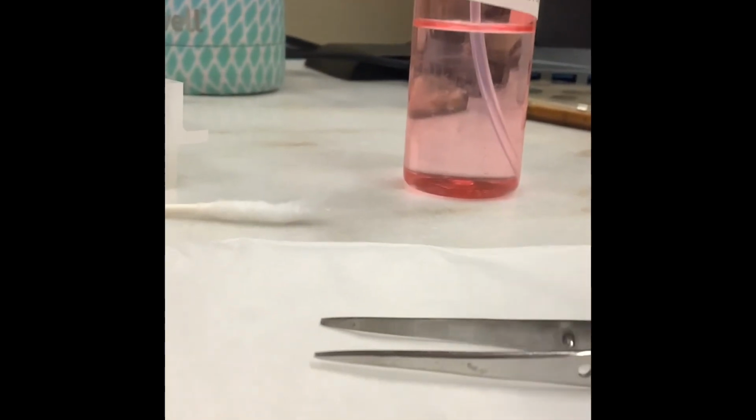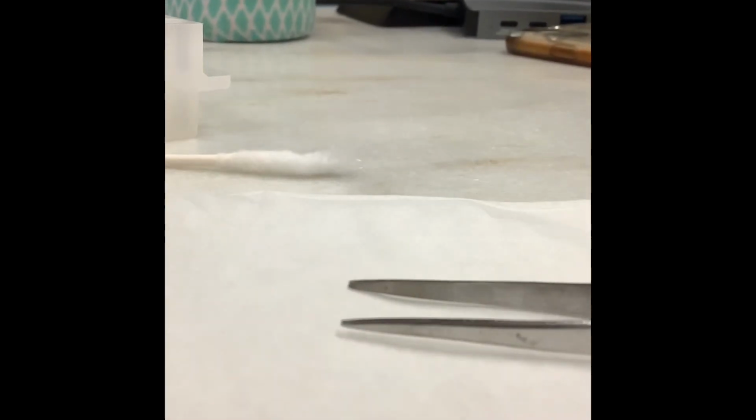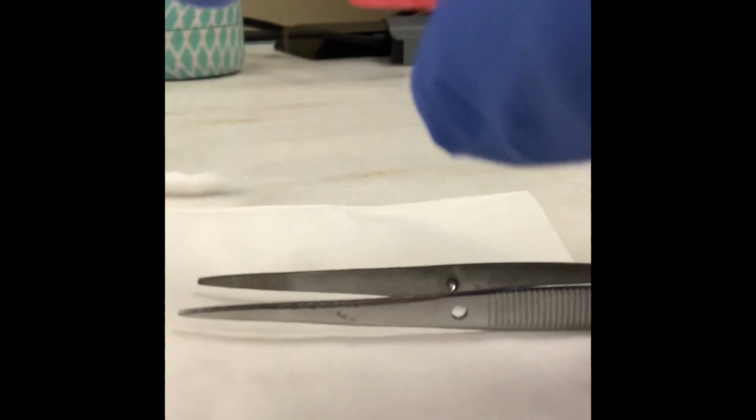And I forgot to mention, but after each sample, I am spraying down my forceps and then wiping them with a fresh Kim wipe. And the purpose of this is to limit cross-contaminating your samples. So you want to wipe those down really well and use a new Kim wipe every time.